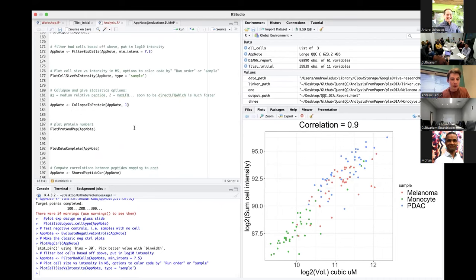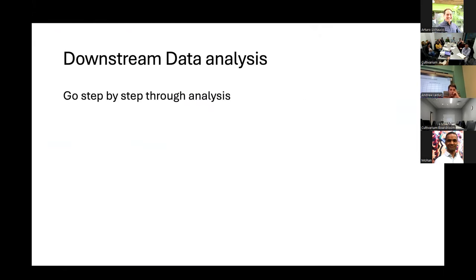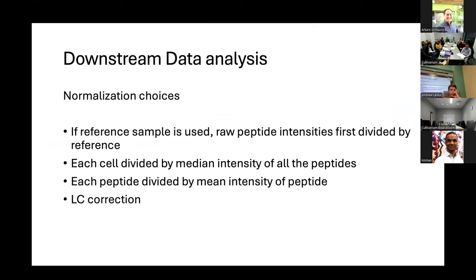And then here we're collapsing to protein level. This will take a quick second. I can tell you about some of the normalization choices that we make to get to this collapse to the protein level. So first, if a reference sample is used, either in a SCoPE-DIA style experiment or if you have TMT with a reference channel, the first step we do is divide the raw peptide intensities by that reference channel.